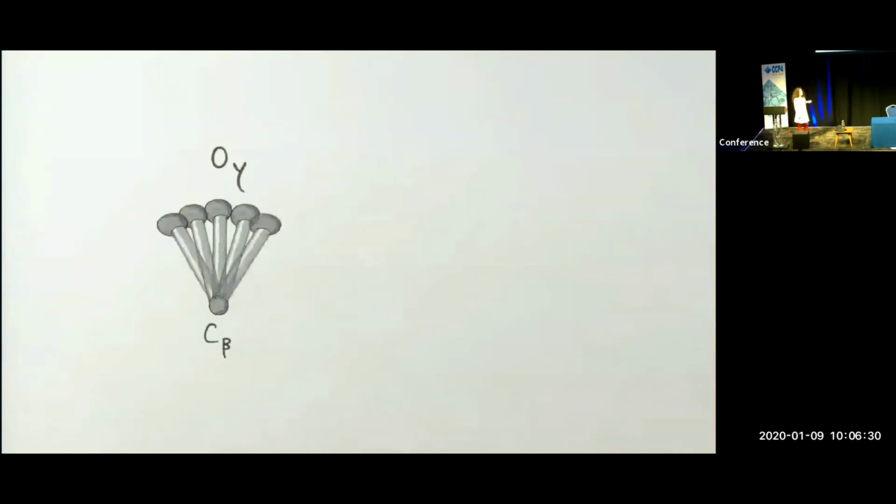And to show you the long range effects of this, if we have a terminal bond here, I've displayed the carbon-oxygen bond of serine and the range of possible oxygen atom positions. Here's the banana. Now, the more spread out the atoms become, the curvier the banana becomes. And as the banana becomes more curvy, the center of mass of the banana starts to fall off the surface of the banana.